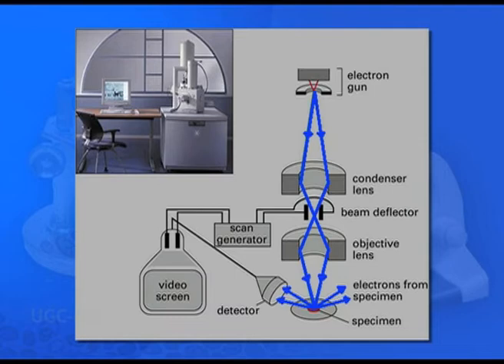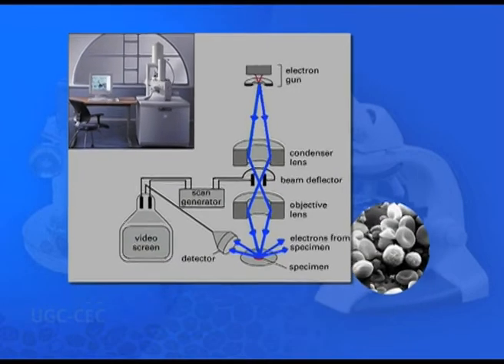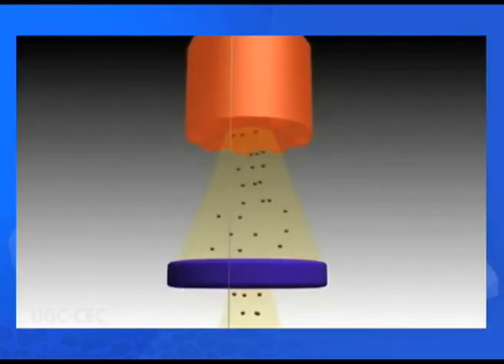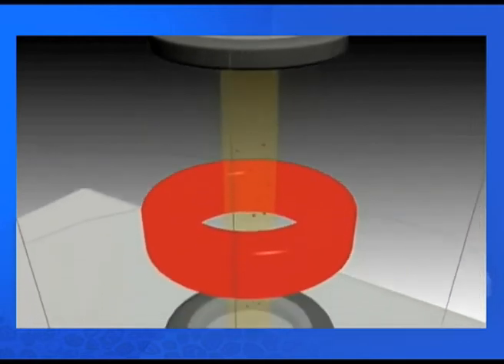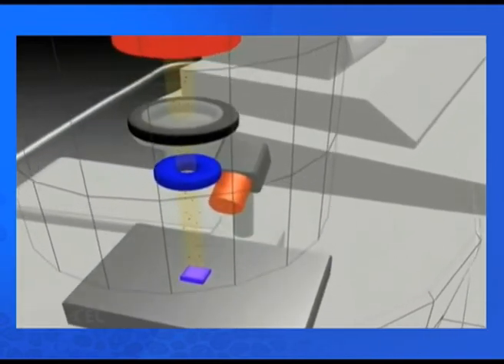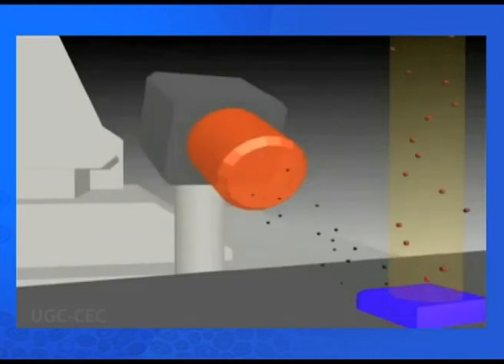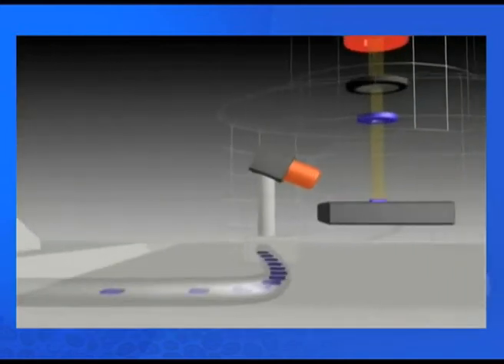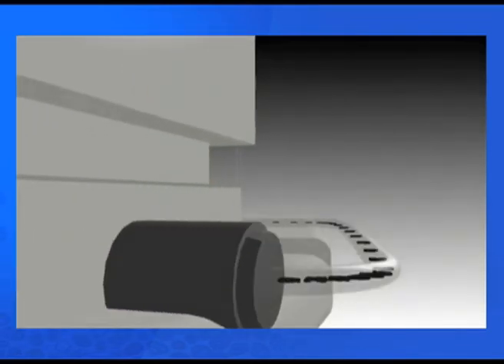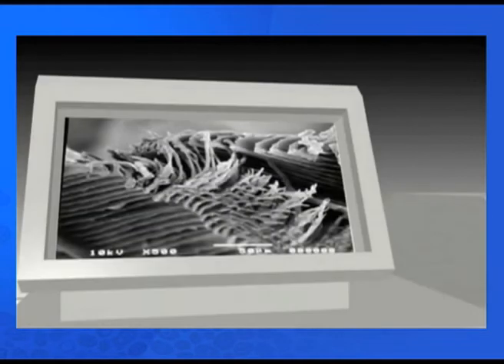These secondary electrons provide signals carrying information about the properties of the specimen surface, such as its topography and composition. Generally, the image resolution of a scanning electron microscope is poorer compared to a transmission electron microscope. However, because the image relies on surface properties rather than transmission, it is able to image bulk samples up to many centimeters in size, and it has a great depth of field, so it can produce images that are good representations of the three-dimensional shape of the sample.